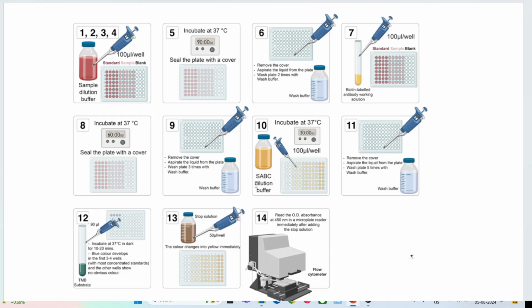This is from Thermo Fisher. We have taken how exactly ELISA is performed at different scales. So you can see here we have 96 wells, which is 12 by 8. Now these wells you can plate with the antigens, or with antibodies already fixed to them.